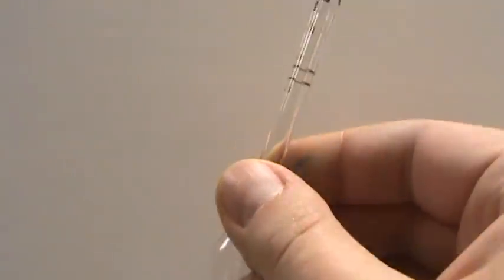What's this other one? The other mark that you see here is labeled TC. And TC means to contain. So if we were to bring the liquid up to the TC line on this pipette, then this 8 milliliter pipette would contain 8 milliliters of liquid. That's pretty good.